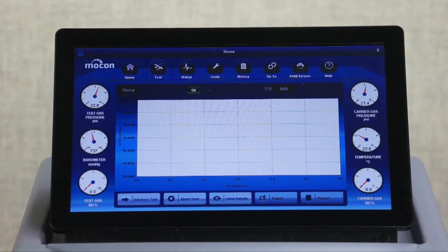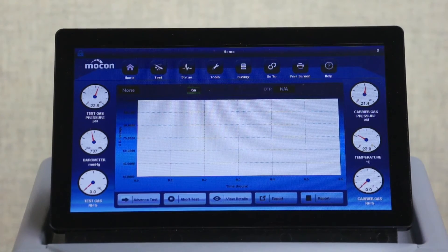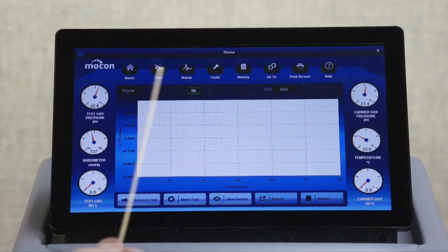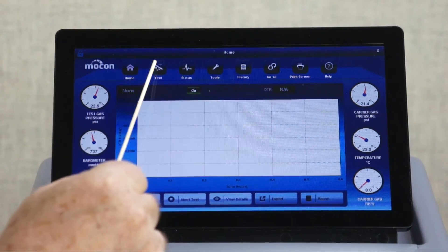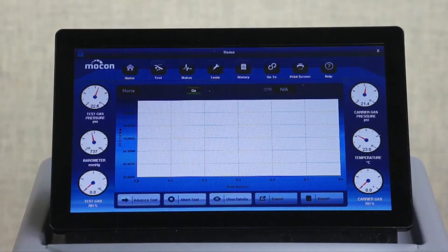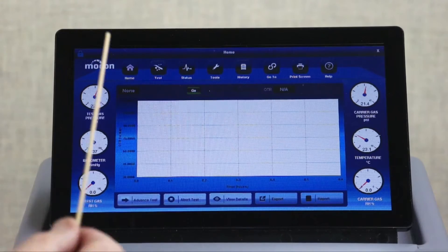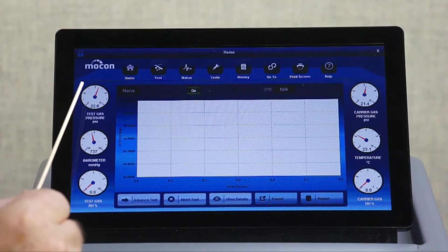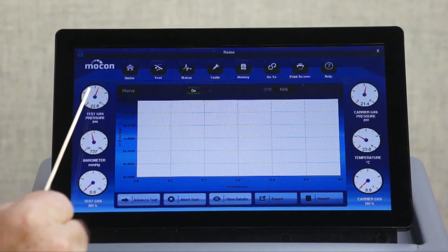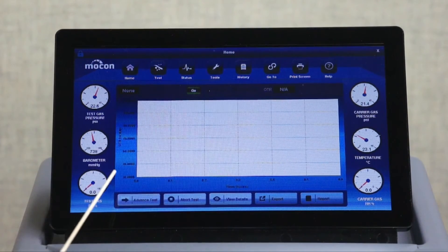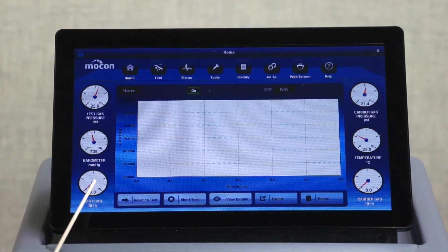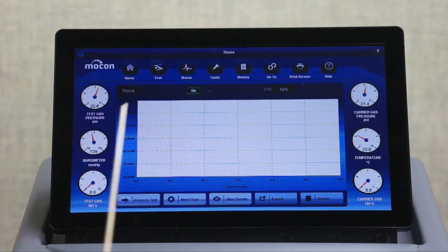The touchscreen is where operators will spend most of their time. Here is where they start tests and view their status. On the left you'll see gas pressure, barometer pressure, and test gas RH.